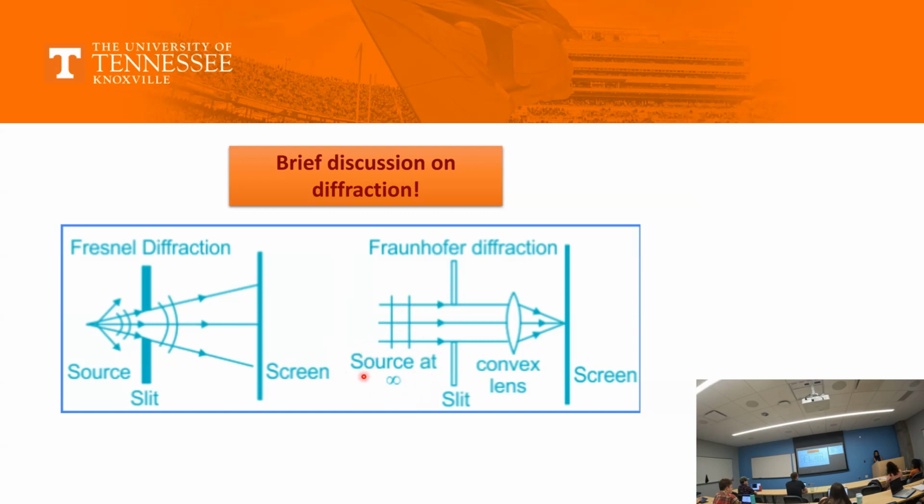And this one is actually one of the best representations of the microscopy that we do. There are different ways in which you can understand what you are seeing on the screen. Your reciprocal lattice is definitely one of the best ways to imagine it. But another way that comes closer and would help you understand why you are seeing this diffraction pattern is this.